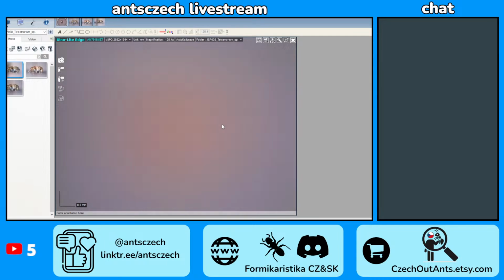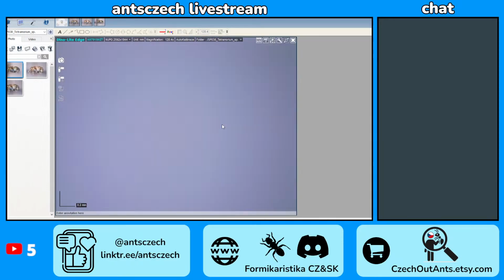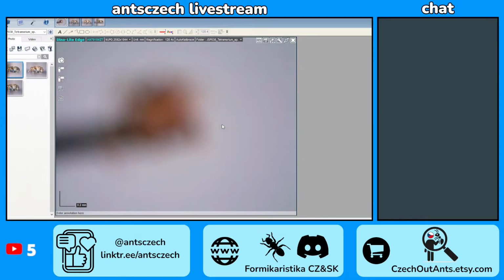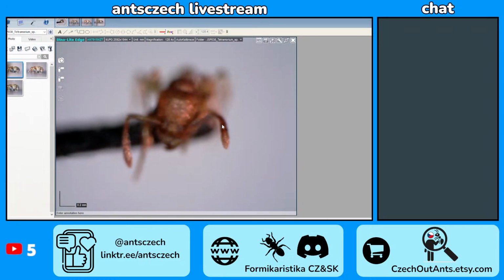I hate cameras that have such a small working distance, and if I place the diffuser on this camera I lose like 2 centimeters, and at magnifications around 100 the working distance is extremely small, so I have to take the diffuser out.